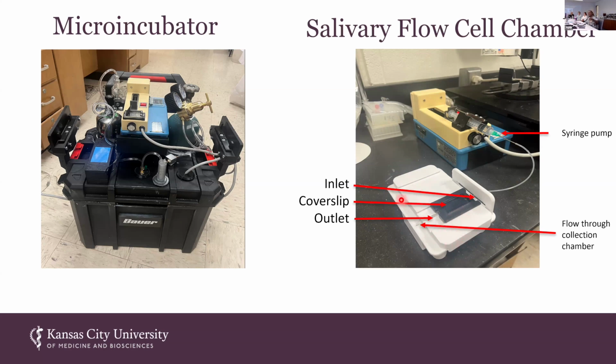Then here we have the syringe pump, which we filled with a 1:4 ratio of pure saliva and Krebs-Henseleit buffer, which is a physiological buffer. The pure saliva was centrifuged and the supernatant was filtered with a 0.2 micrometer filter. The saliva here serves as the sole nutritional source. I run it at a very slow rate of about 0.4 mL per hour. And so that's what we did.